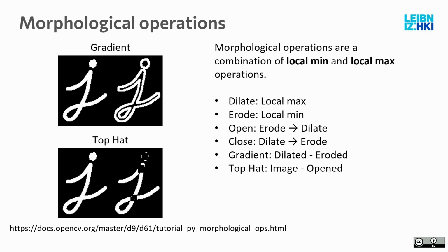Then you have some also funny ones. The gradient operation is very useful if you want to turn a mask with an area into an outline. And the top hat, here you see why it's not used so often. We have actually seen what the top hat does with the glomeruli. It's extremely good at highlighting blobs and ridges.